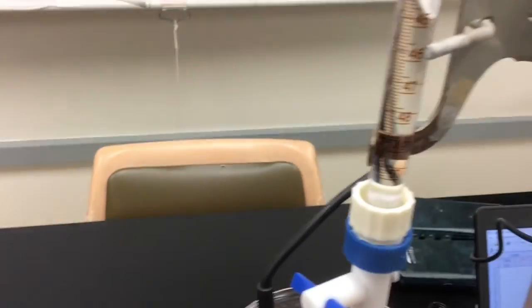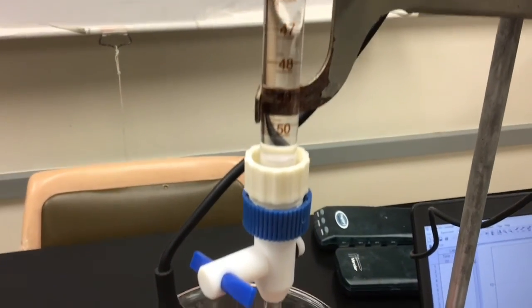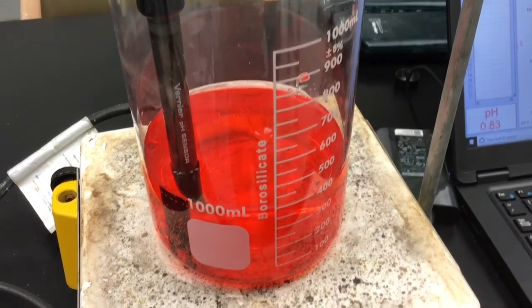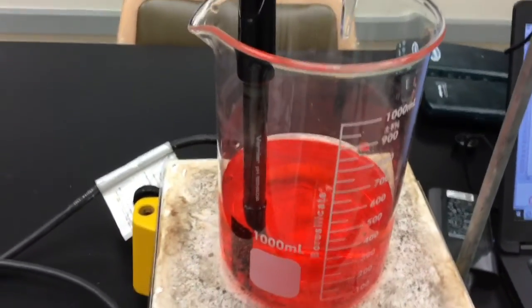Now, I have a burette here that is filled with sodium hydroxide, and the sodium hydroxide is a base. So what's going to happen when I start adding a base into this red solution here? Well, obviously it's going to neutralize it, right?